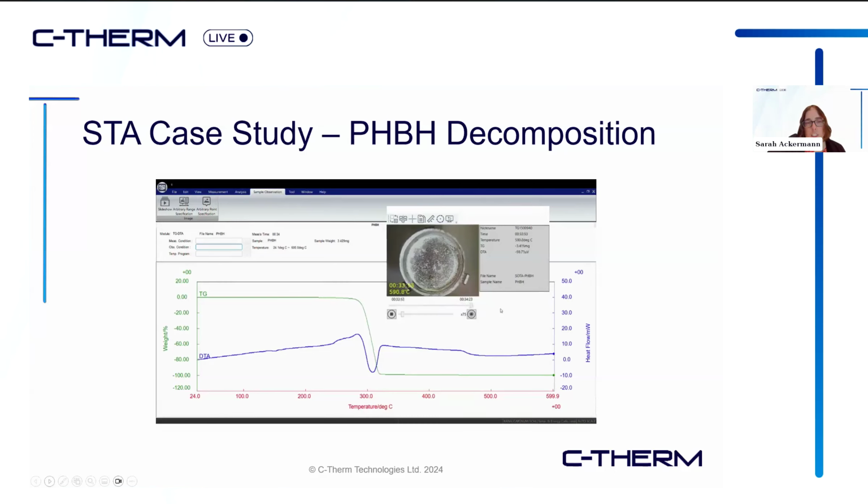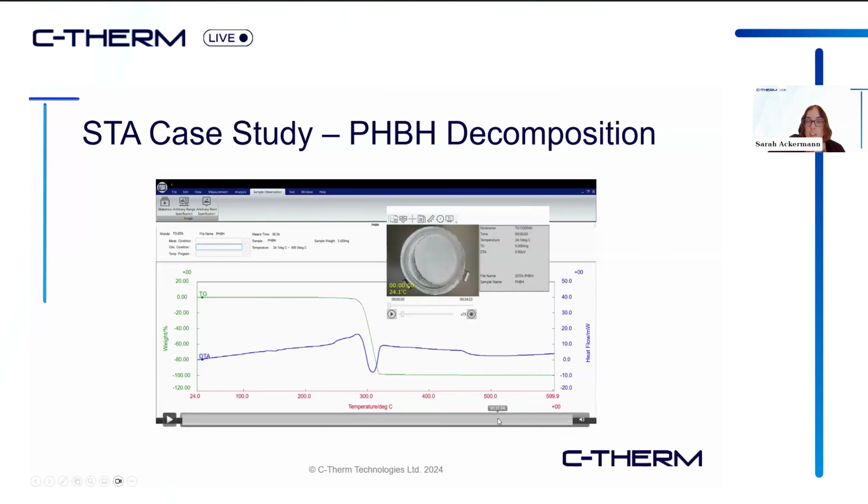You can also get an appreciation for just how much more sensitive DSC and sample observation are to residual combustion by observing the DSC behavior here. So the DSC does not go to baseline completely until almost 200 degrees past when the TG has stopped showing significant mass changes. And we can see that sample observation is a little bit more sensitive still.